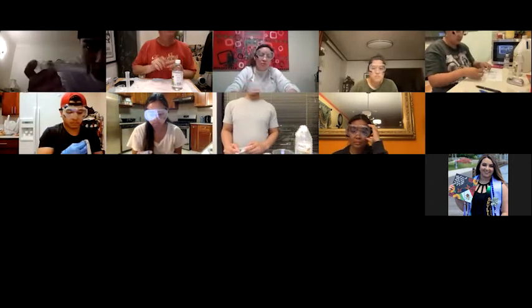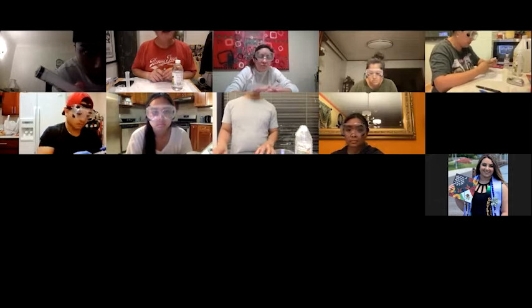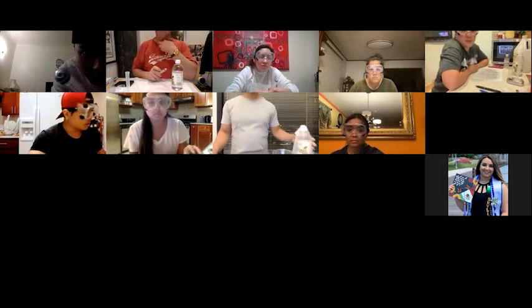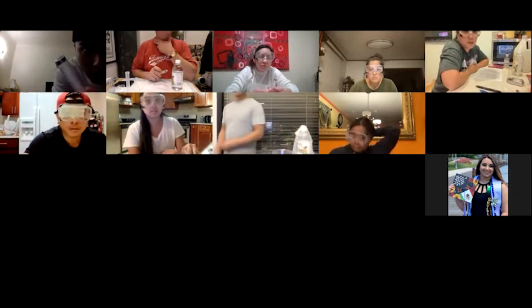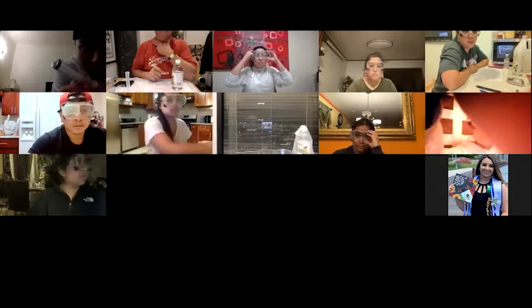Would this still be usable? Or would the measurements be different because it's missing that portion? Actually, I don't think it'll matter that much, as long as it doesn't leak out the bottom. If it leaks out the bottom, then yeah, that won't work. But if it doesn't, then I think you're fine.